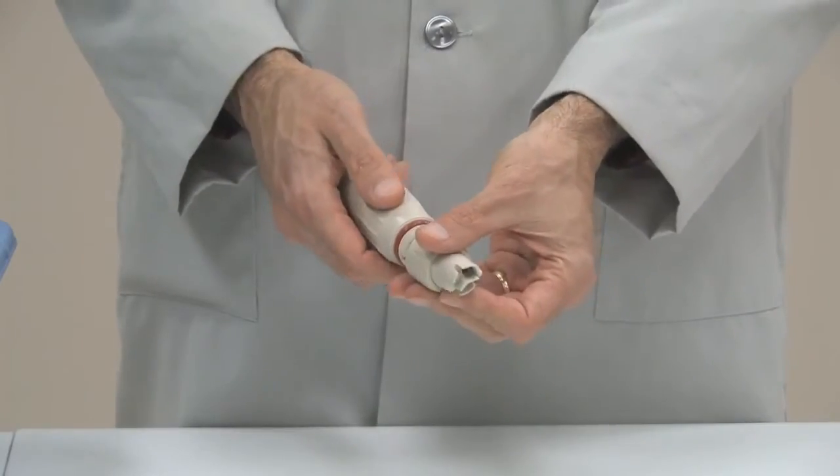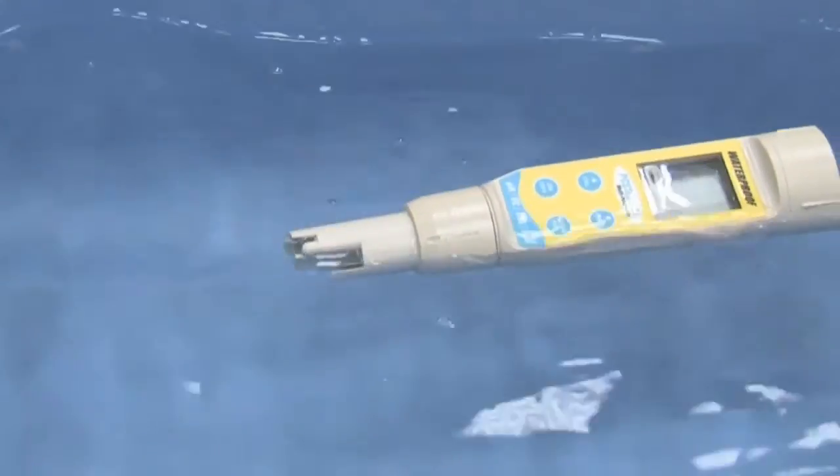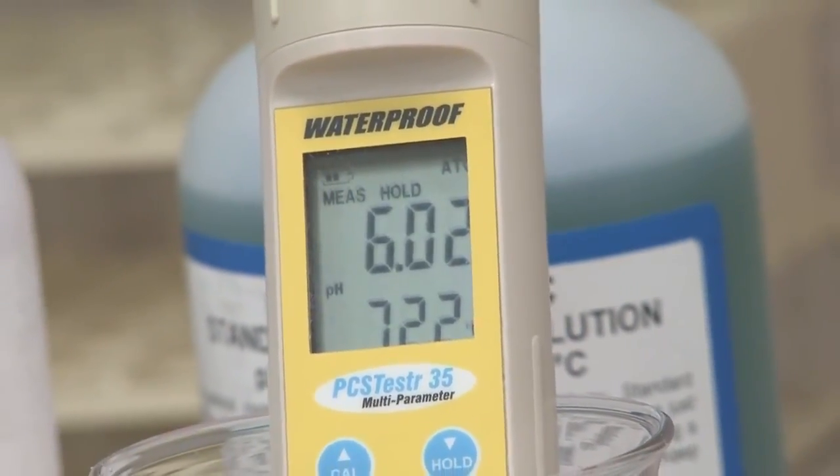Easy-to-replace sensor modules keep costs down — simply twist off and replace. Of course, the Oakden 35 Series testers feature waterproof housing that even floats. Accuracy and reliability at competitive prices. Look to Oakden.